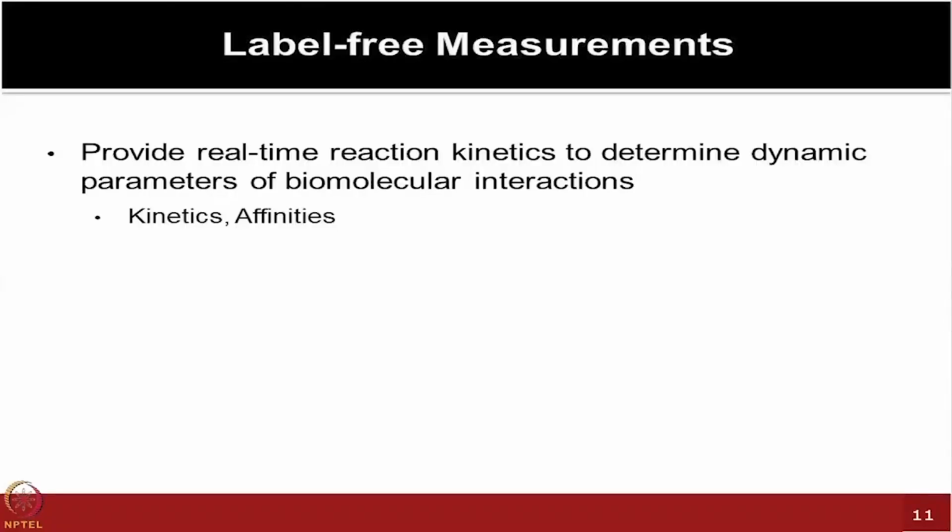All right, so all the label-free measurements, irrespective of which platform we talk about, are measuring the biomolecular properties pretty much without changing anything on them, and it's adding information which provides you either kinetics information, or you are looking at the affinities. These are added information which one could obtain along with just the yes or no answer which you can obtain from other binding experiments.